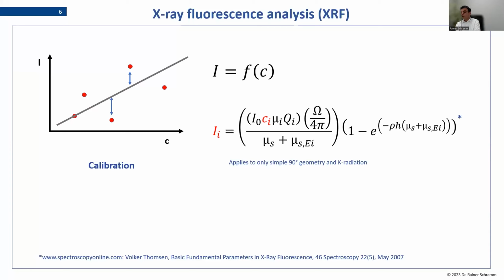So, can you explain again the example of the polymer with titanium? Yeah, the idea of that slide was that I'm analyzing titanium in different polymers. For the XRF, all the polymers are the same because we cannot measure it. But in the real world, the polymers are all different and absorb the titanium result differently. The quality of the titanium result depends on how well I describe the matrix. I have to enter it into the software, and only then my titanium result will be correct.